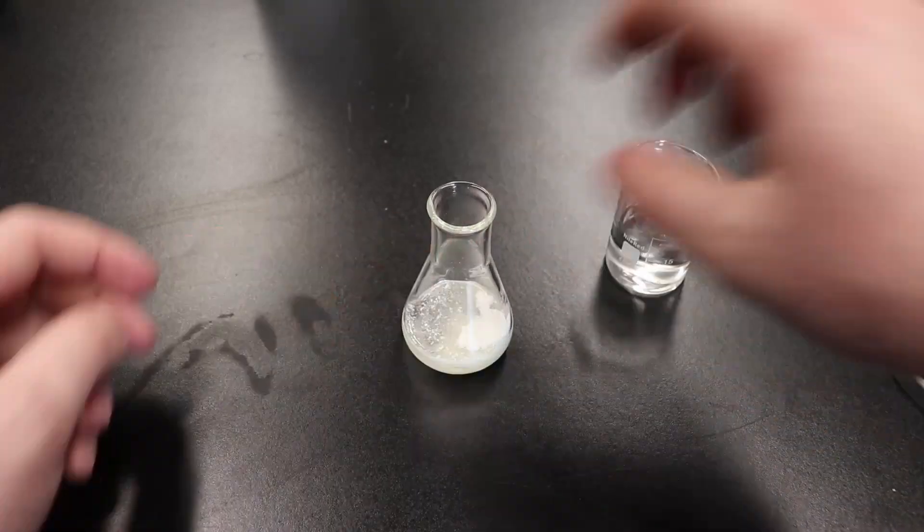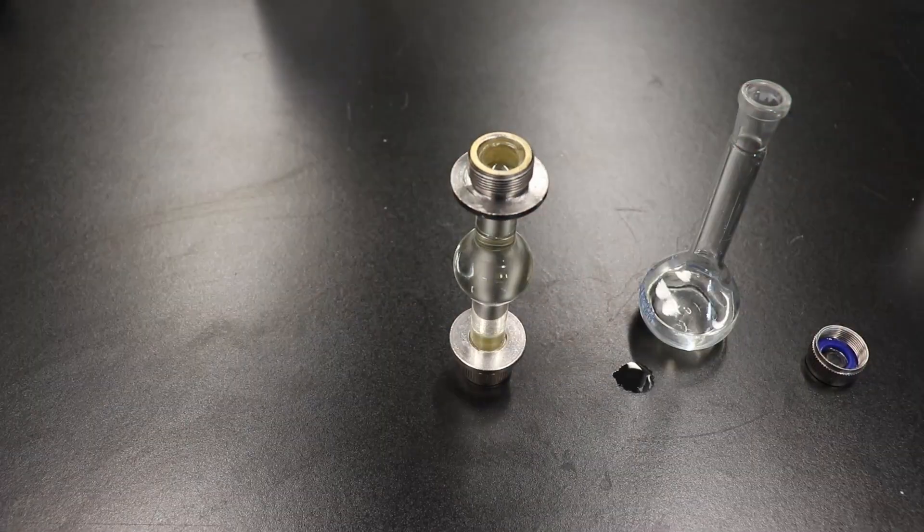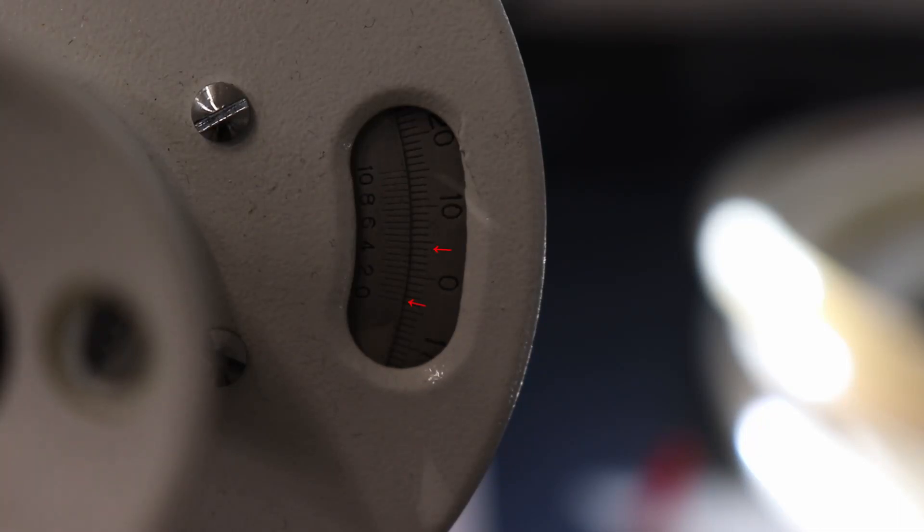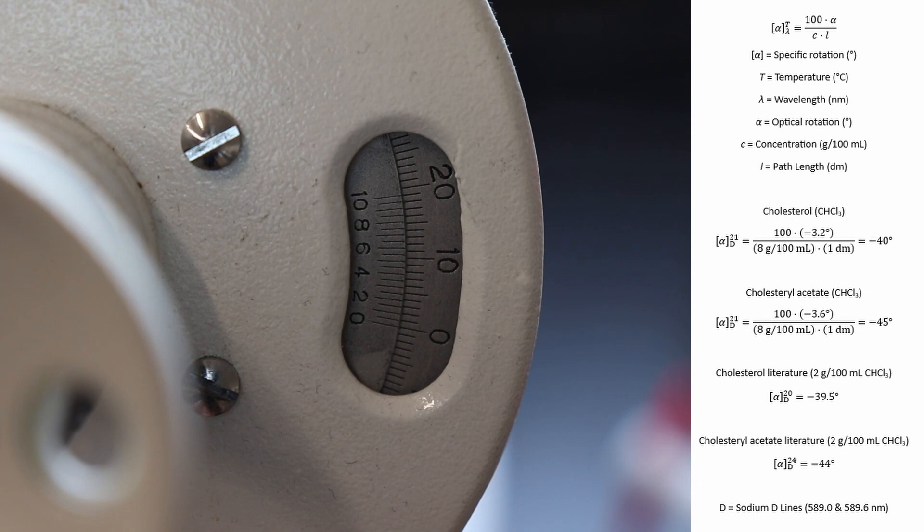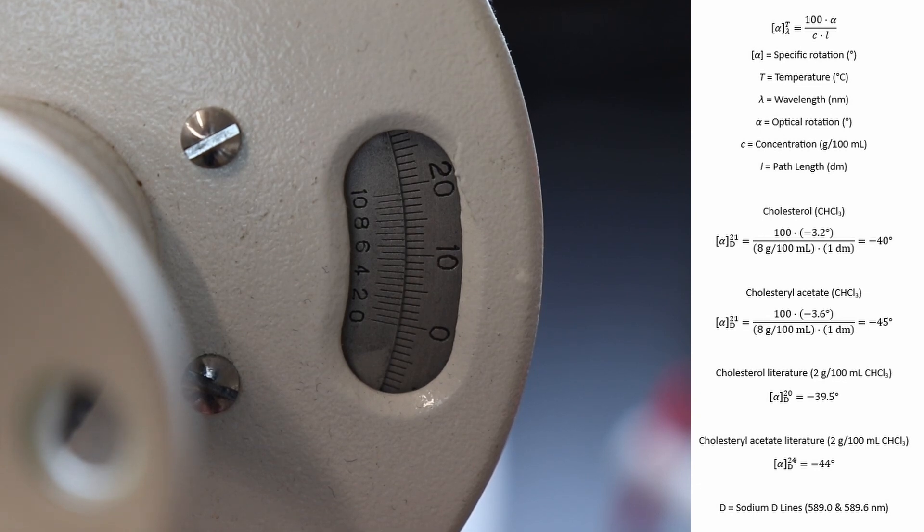I then prepared a solution of cholesterol acetate in chloroform at a concentration of 8 grams per 100 milliliters. I then measured the optical rotation of the solution and found it to be negative 3.6 degrees. Now that I have the optical rotations of both cholesterol and cholesterol acetate, I can calculate the specific rotations. I calculated the specific rotation of cholesterol to be negative 40 degrees, which matches well with the literature value of negative 39.5 degrees.